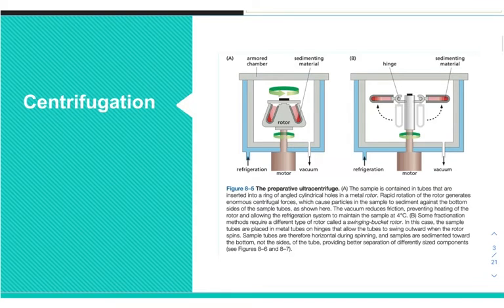You might have heard of ribosome densities that are different in prokaryotes and eukaryotes, and that was measured with a density gradient, where at the top of the tube you have really dilute solution, and in the bottom of the tube you have really concentrated solution. As you go down, the difference between the centrifugal force and the buoyant force changes, and then you'll get different densities of things you're looking at with the different densities in the tube.